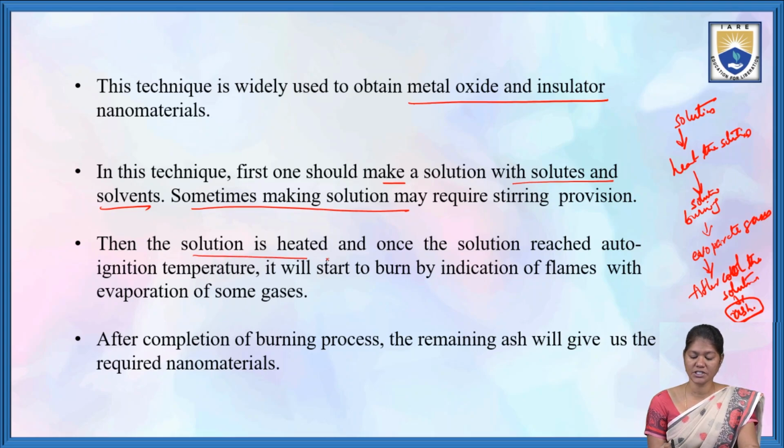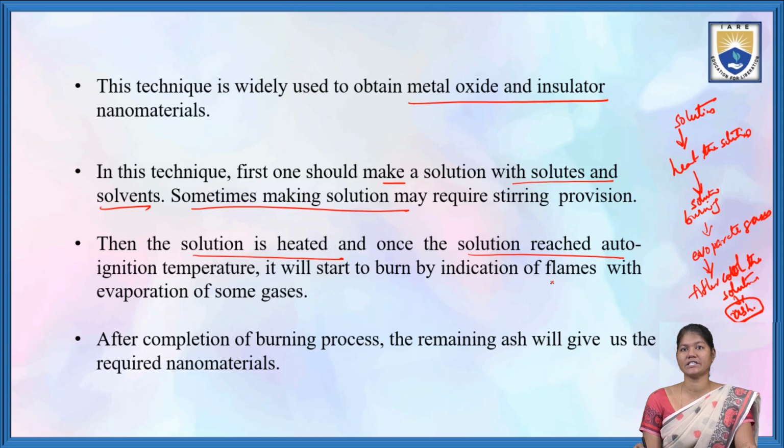Then the solution is heated, and once it reaches the auto ignition temperature, it starts burning, indicated by flames, with evaporation of some gases. After completion of the burning process, the remaining ash will give us the required nanomaterials.